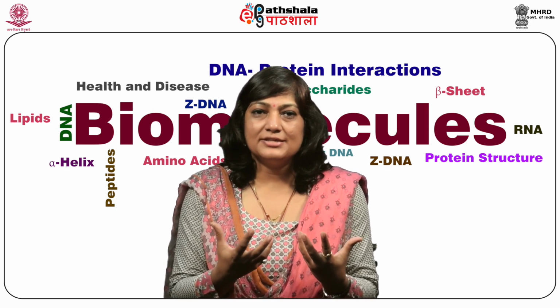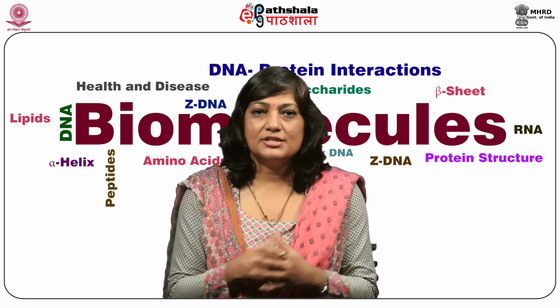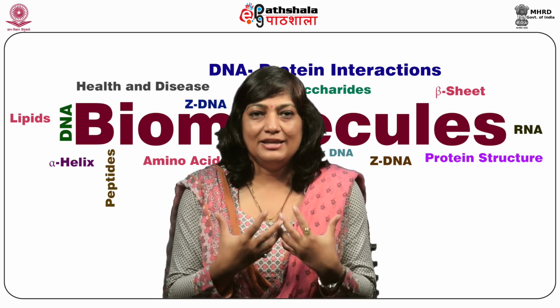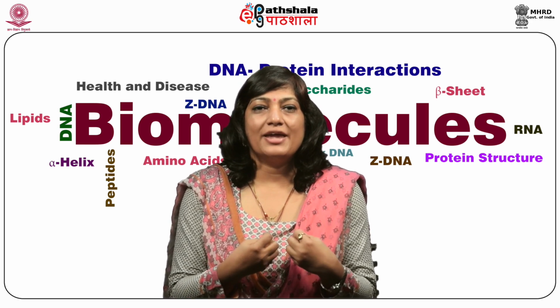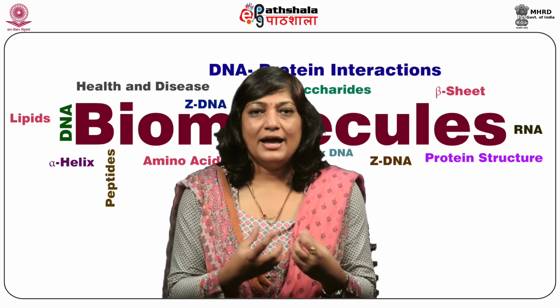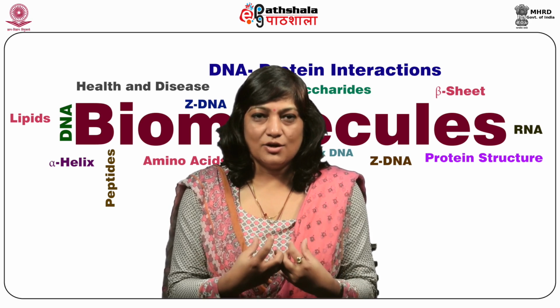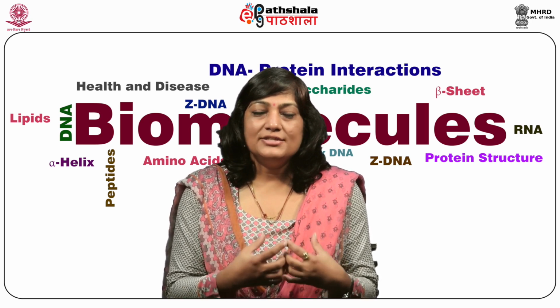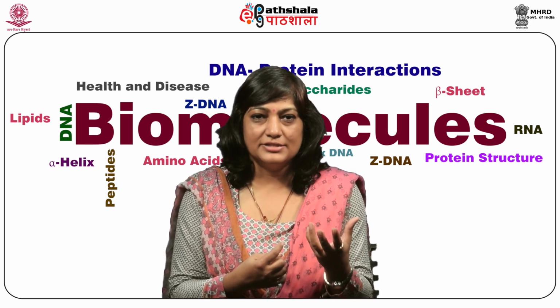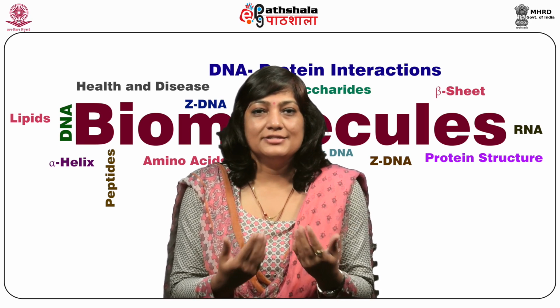We know that lipids are immiscible in water and miscible in organic solvents. So one of the preferred methods of extracting lipids would be to use organic solvents, homogenize your tissue in the organic solvent, and what you will end up getting is lipids in these organic solvents. So once you have a solution that is now enriched in lipids, the next step that you would like to do is separate these lipids.